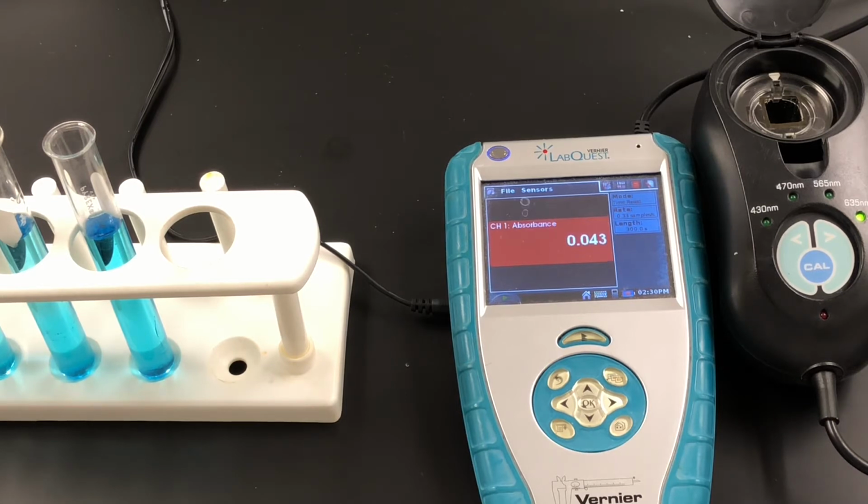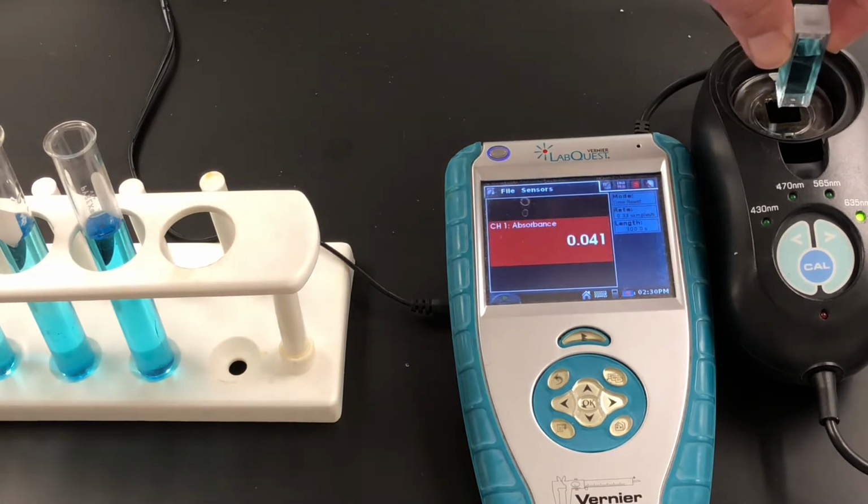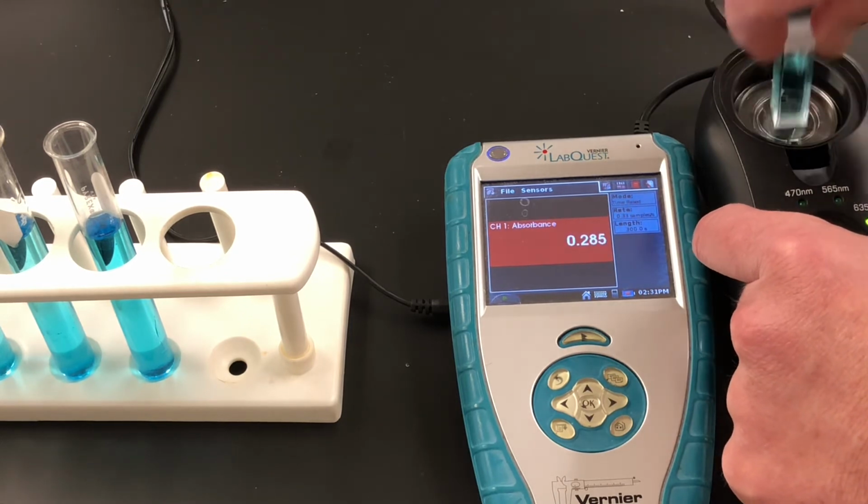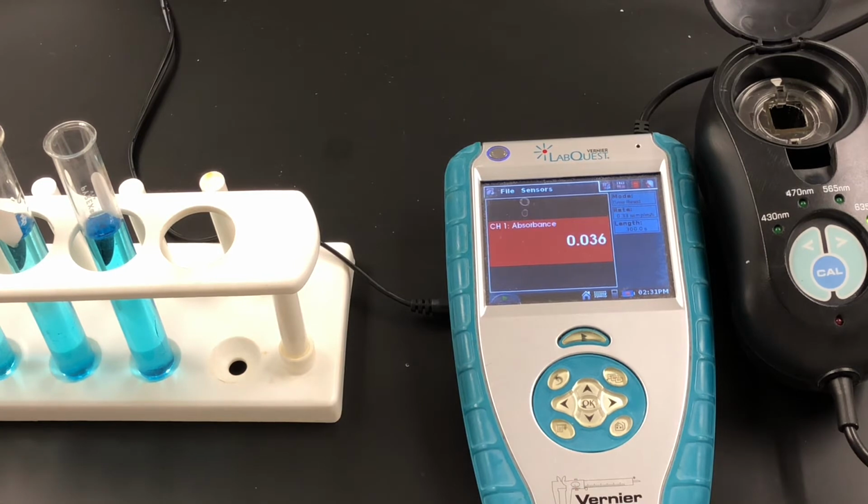So that way it's removed any of the previous one that might have messed up the sample at all. So we are on sample 3 now.